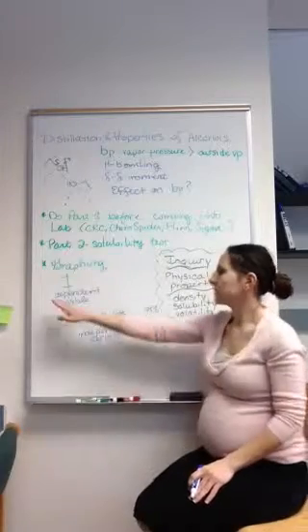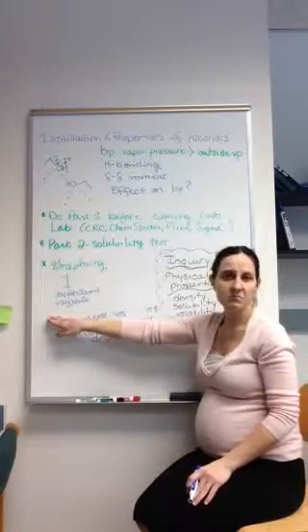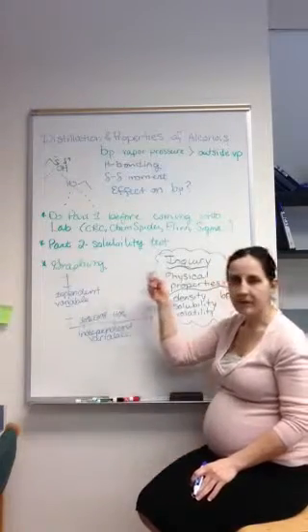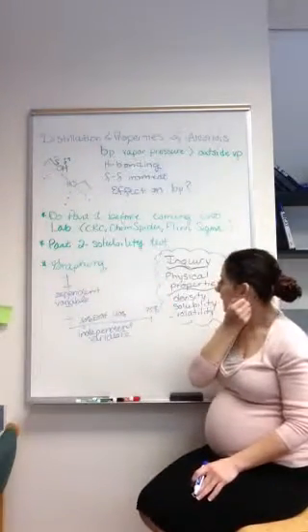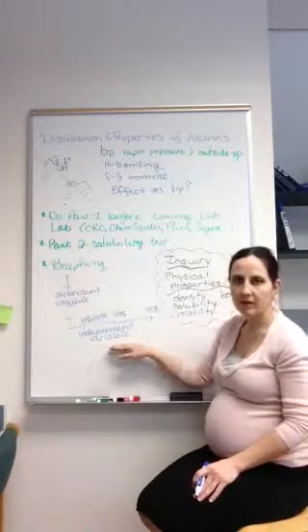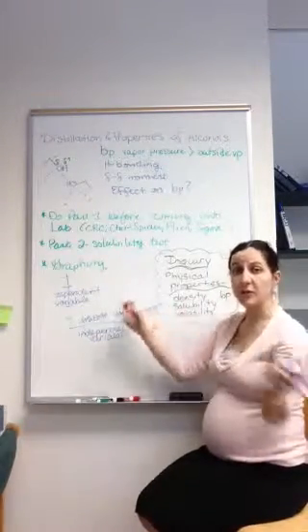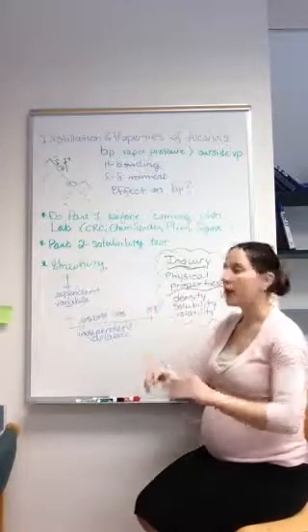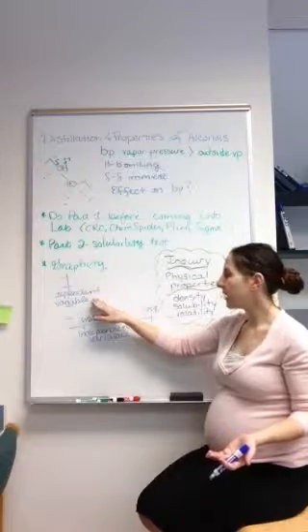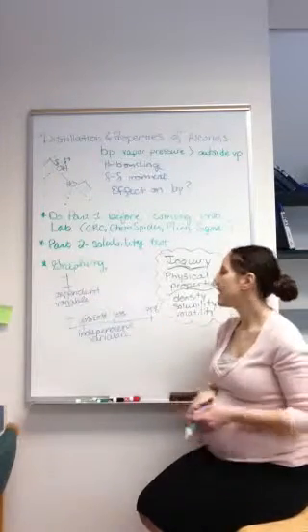Your labels might be in minutes or seconds, and then you would plot accordingly. A couple of things to think about: whatever you are controlling in lab goes on the x-axis, so whatever you're actually putting in and setting up goes on the x-axis, and whatever you're measuring as an outcome of that goes on the y-axis.